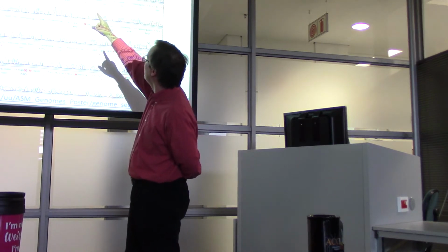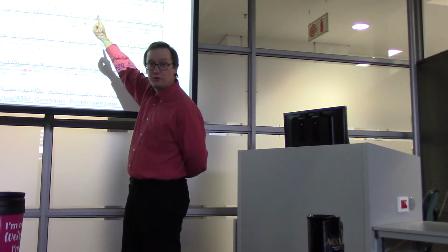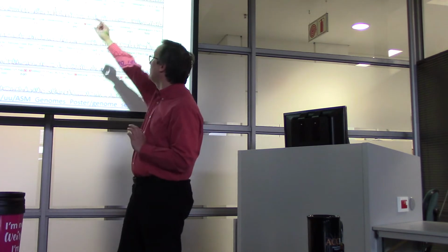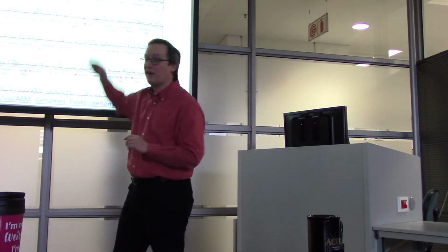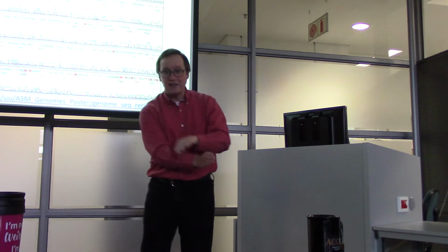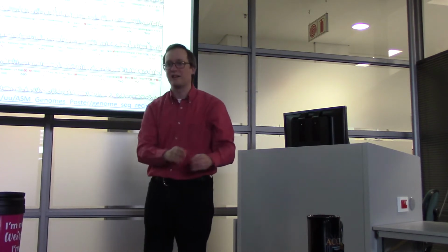Now, I want you to note that the resolution, the distance that these peaks appear from each other, gets a little worse as we start up at, say, 70, where you have baseline resolved bases, nucleotides. The peak for this nucleotide rises and falls all the way to the baseline, and then the next one rises and falls to the baseline again.